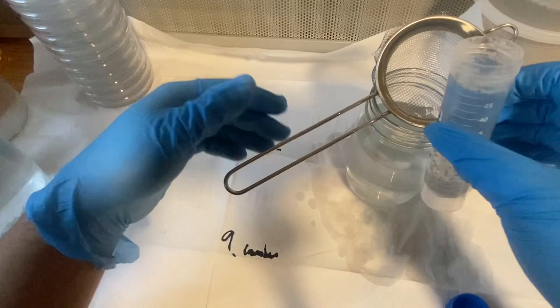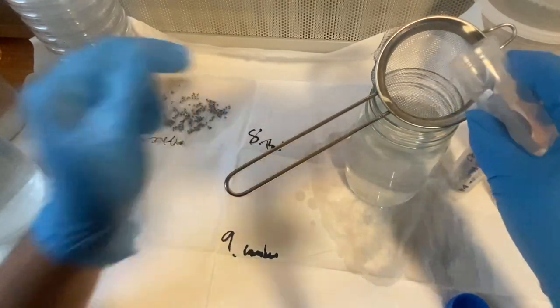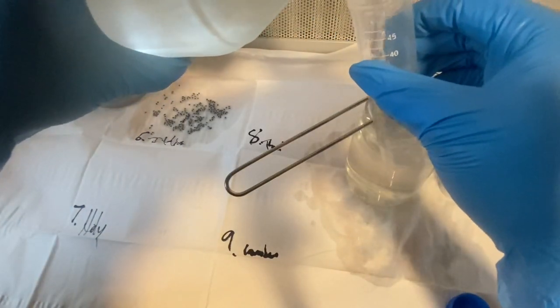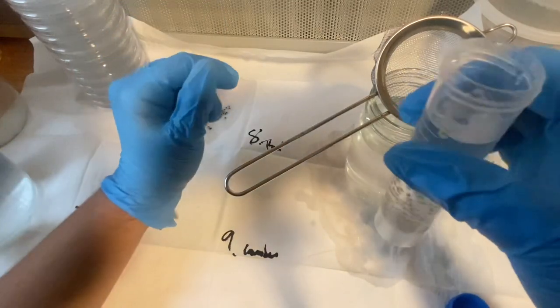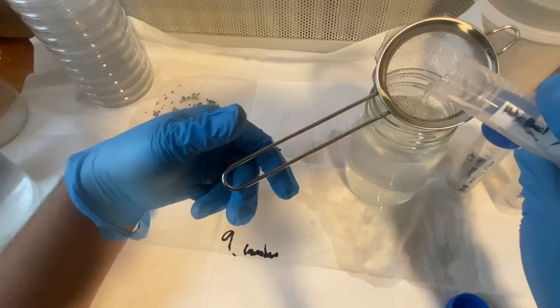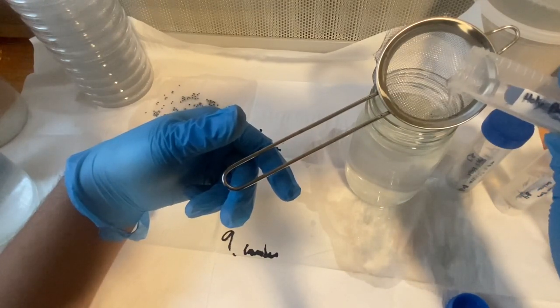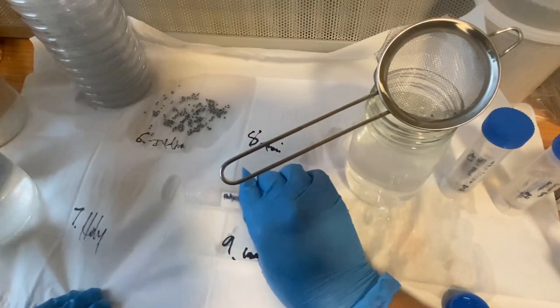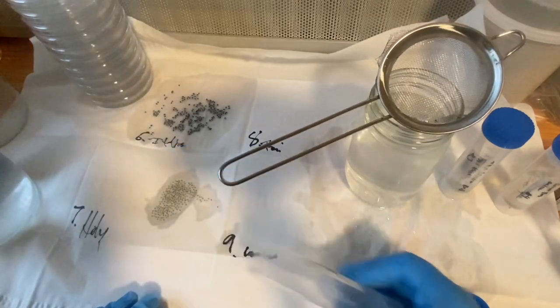Sorry, I'm looking at the camera. That's why I'm spilling so much. But let me just focus on what I'm doing. There we go. That's how you want to do it. So nice, good three rinses. Let that go down there. Might lose a seed or two, but that's okay. And then I'm just going to go ahead and dump that out to dry.